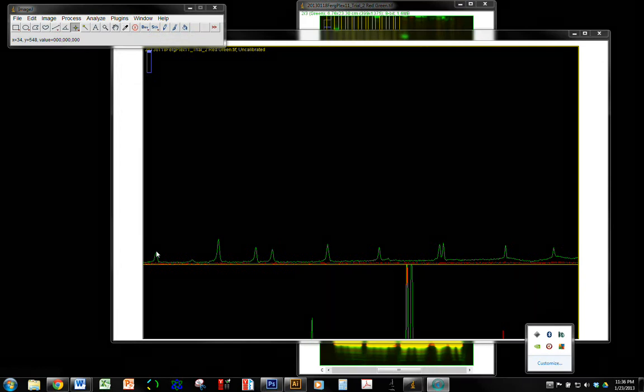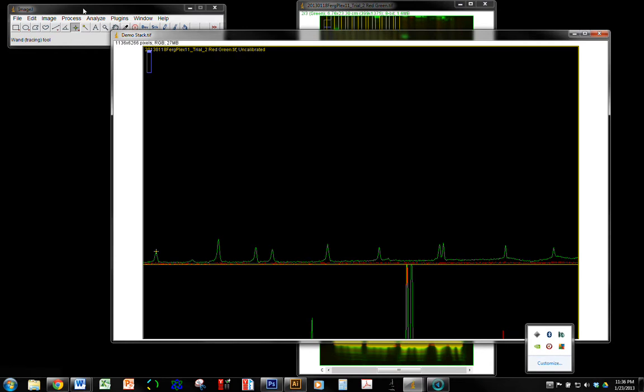Okay, now that you have your point selection tool, you're going to move down here and select the tip of each of the peaks. I'm going to move from left to right. You can see I get this little yellow point with the crosshatch on it. You can adjust its position using the arrow buttons on the keyboard until it reaches the very peak of your peak there. That corresponds to the center of the band on the gel.